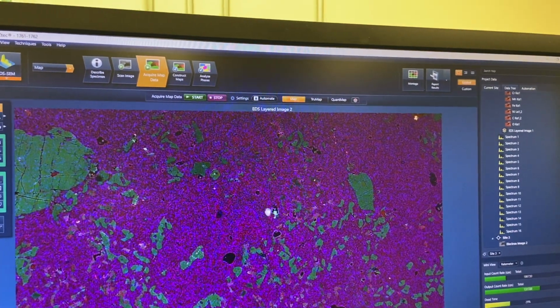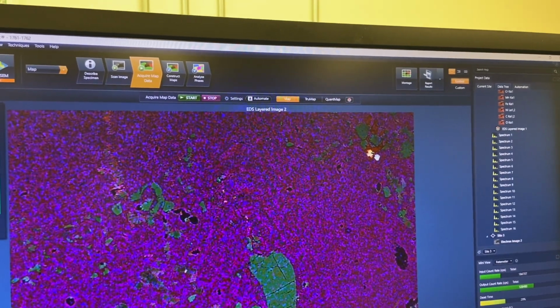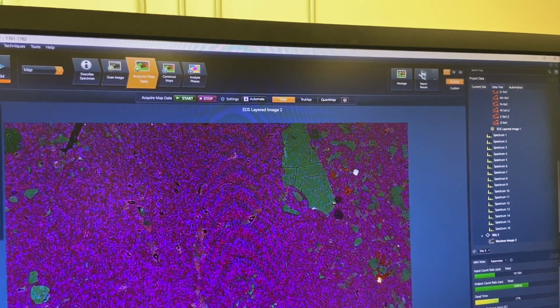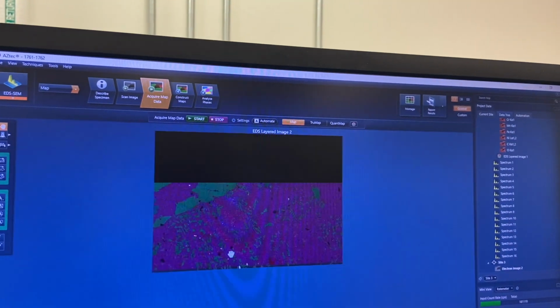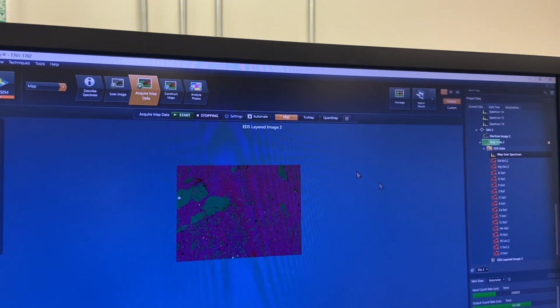So there, maybe that's metal there. Maybe that's sulfide. I have to see what that is. Could be just some thing with, yeah. Okay. Looks like we had some zonation in that olivine, so maybe it's not all the same thing as I initially thought. So that's good. Let me stop that right there. Let me actually get some points now.